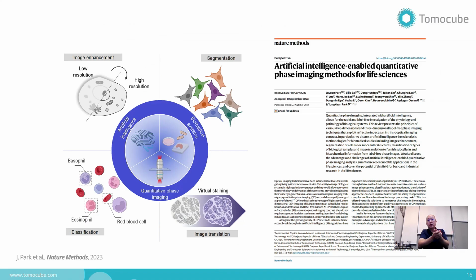First, we are dealing with large data size, high resolution, 3D time-lapse. We can easily generate terabytes of data, and we are generating new information that people haven't seen before. So I think it is crucial to combine HET and AI. By doing that, we can open up several opportunities and areas of research.